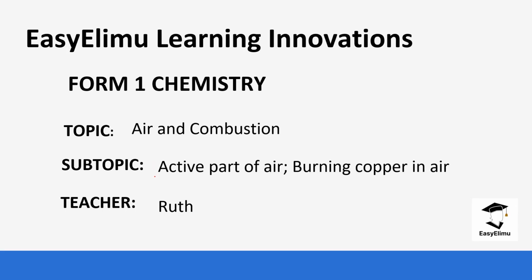My name is Ruth, and today we are going to be talking about Form 1 chemistry. Our topic of discussion today is air and combustion, and our subtopic for the day is the active part of air. The experiment we are going to be looking at today is burning copper in air.